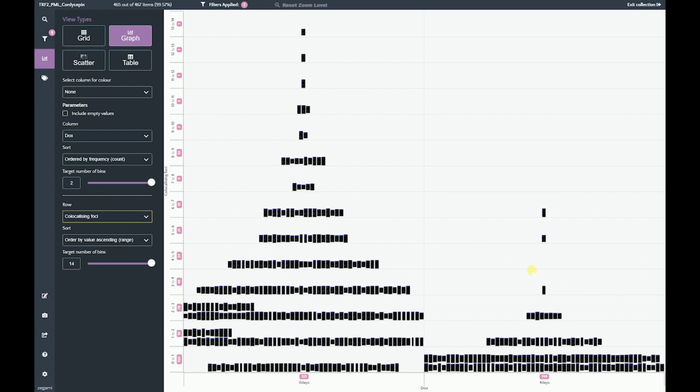So the other nice thing about this is we can make this a public collection and share this. And this is what we did in the paper. We actually took the 16 or so screens and we made these available as hyperlinks, so the collaborators and reviewers can look at every aspect of the system rather than just cherry picking the best results. And that's important because it means research can be transparent and shared to reduce the reproducibility crisis that's often happening in research.